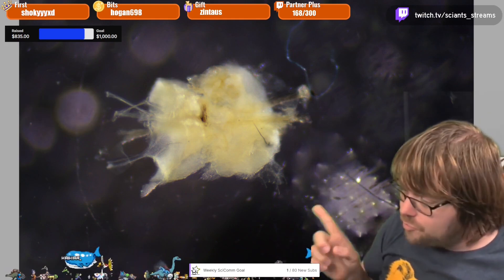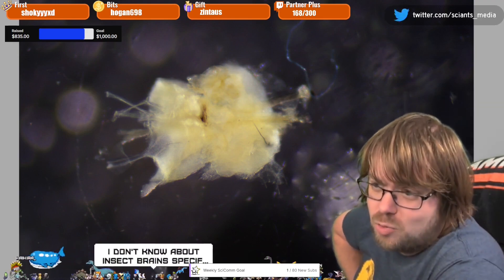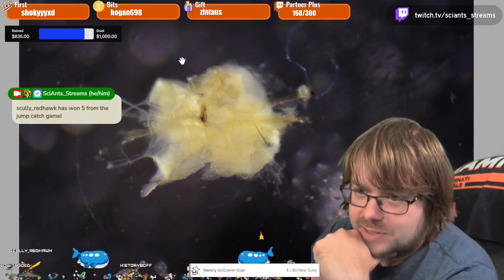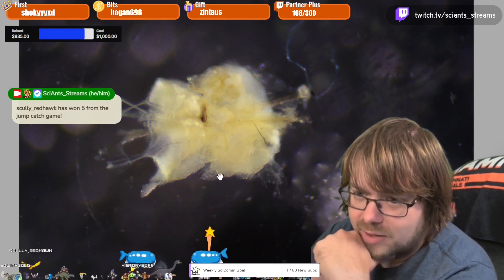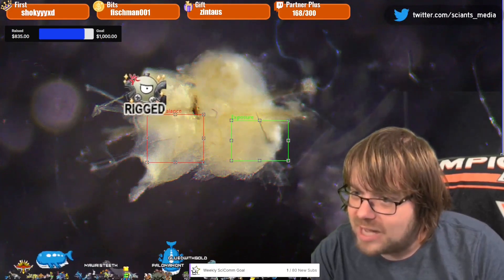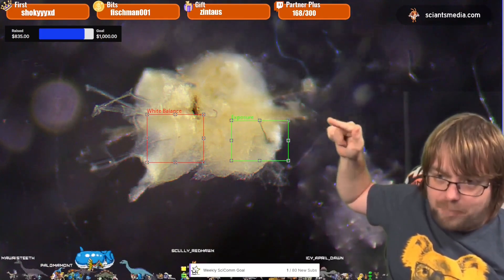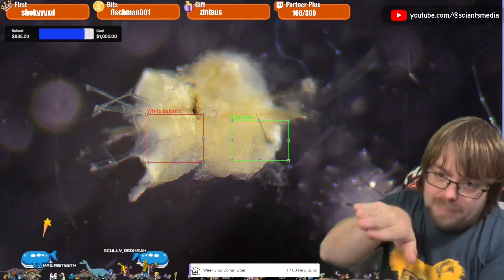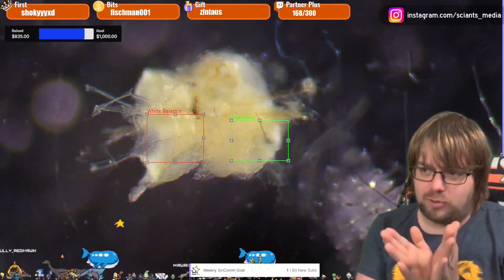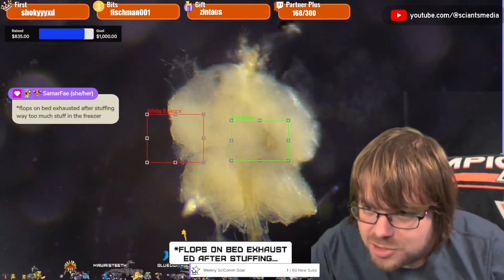I will say I did not nail this dissection - we got the central brain perfectly, but the optic lobes I ripped off. To orient yourself: the top of the head would be here, the mouth is here, and the eyes are here and here. You can actually make out a bit of optic lobe right there. That opacity is because there are fat cells here. The two sticky structures at the back are support tissues. This specimen is actually upside down, so we need to flip it to have it right side up so you can see what the face sees.